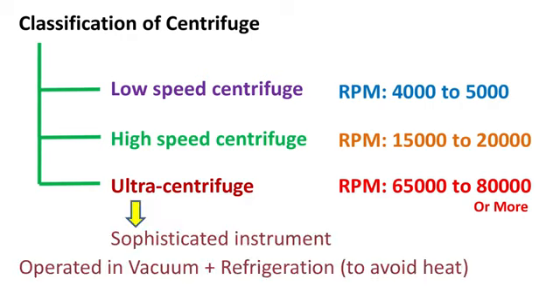An ultracentrifuge is a sophisticated instrument which is operated in vacuum along with refrigeration to control the heat generated at such high RPM.